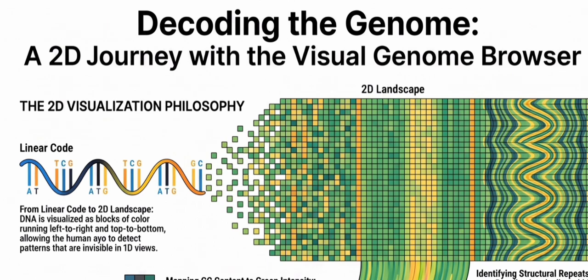But the cross-referencing capabilities of this browser extend far beyond just looking at human patient data. The notes also detail a highly powerful alignment view that allows for cross-species navigation. Right. Local sequence alignment is a cornerstone technique in comparative genomics. It allows researchers to visualize evolutionary divergence.